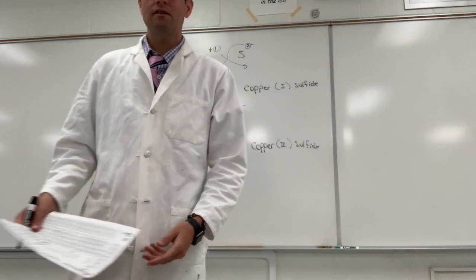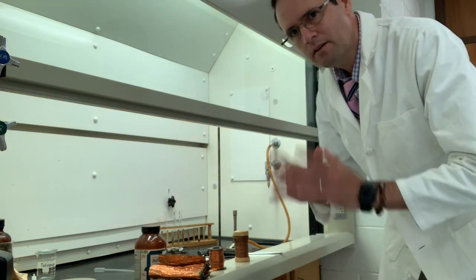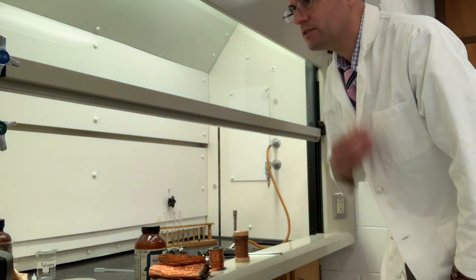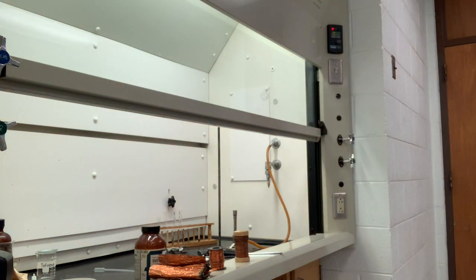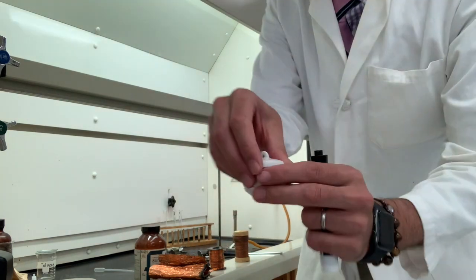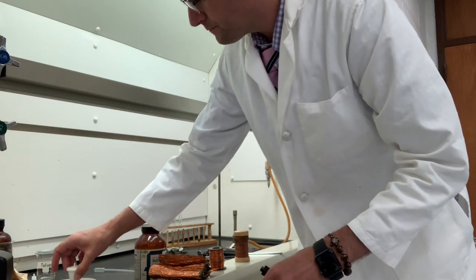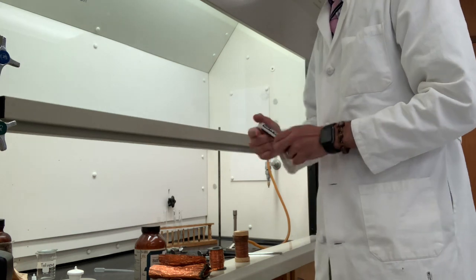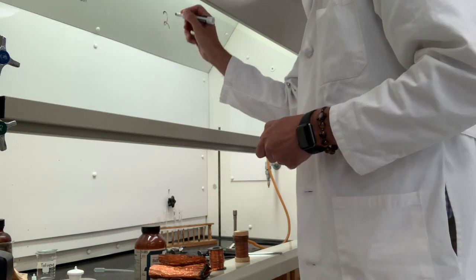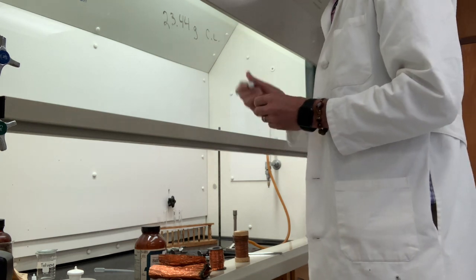We're going to go ahead and start the experiment. So I just want to emphasize this is not the lab, this is just a demonstration, so don't worry about writing numbers down. I'm going to write the numbers down and do every single calculation for this lab. First what we want to do is weigh our reaction vessel, called a crucible and a crucible lid.